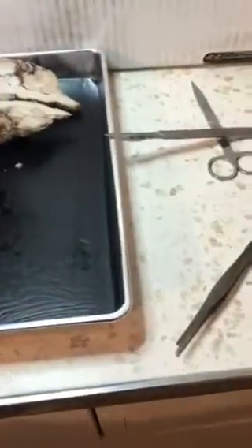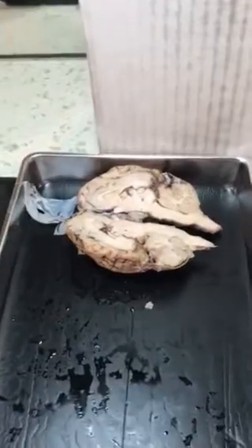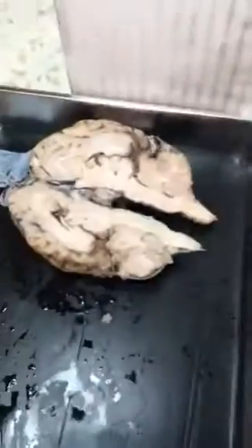For my materials, I've been having an issue with my printer, so I just took that same information that was on the printout and just hand wrote it onto here. So that's what I'll be using. I've actually gone through the dissection once already to realize that my phone was not working and not recording. So I'm going to go through it again. But that's why the brain has already been dissected. So let me set this up.